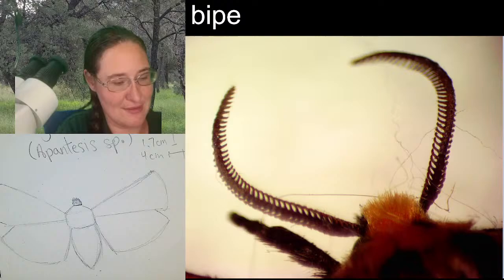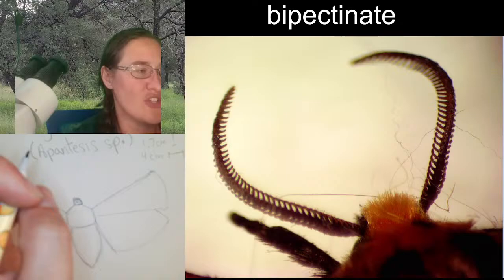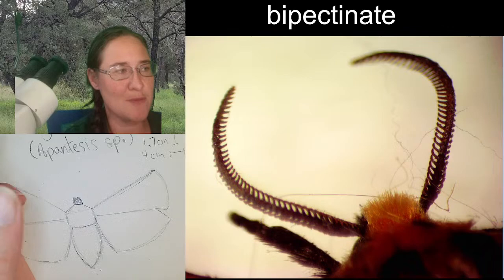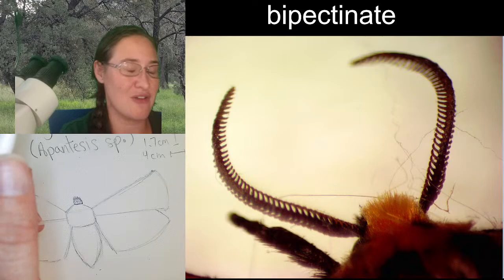Alright, they are bipectinate. Bi meaning two, pectinate meaning comb shaped. So you'll see that on one side it looks like a comb, on the other side it looks like a comb. Sometimes people will mistakenly call a moth antenna a plumose, because when they think of the moth's antenna, they think of a feather. And plume and feather kind of go together.